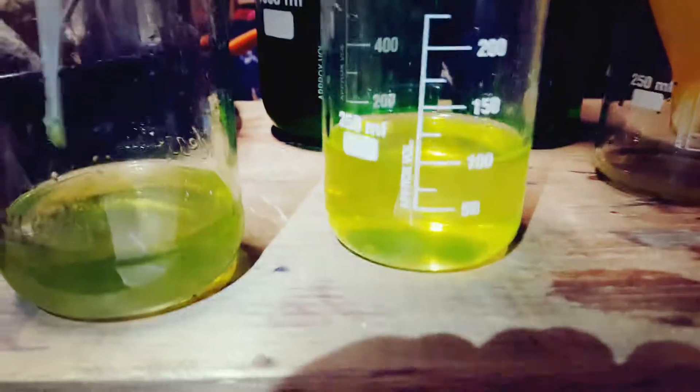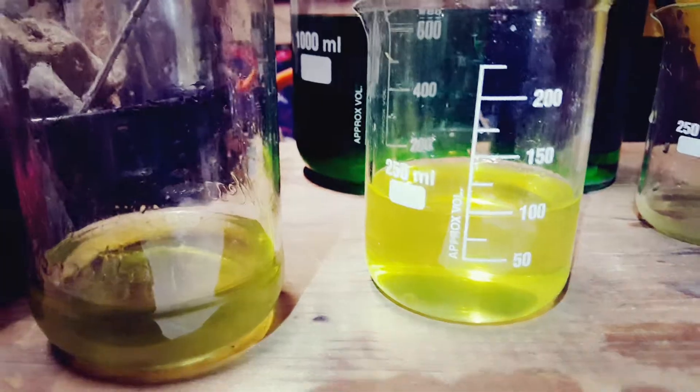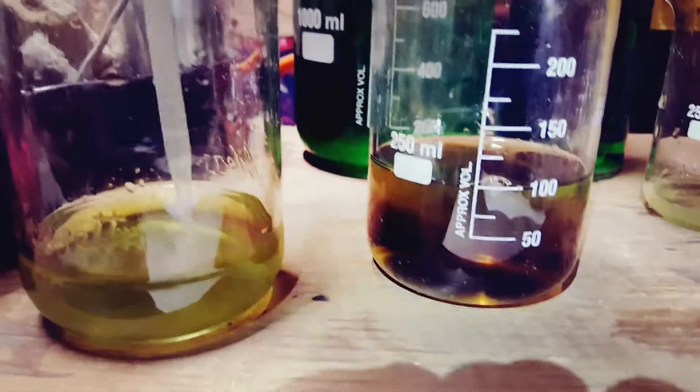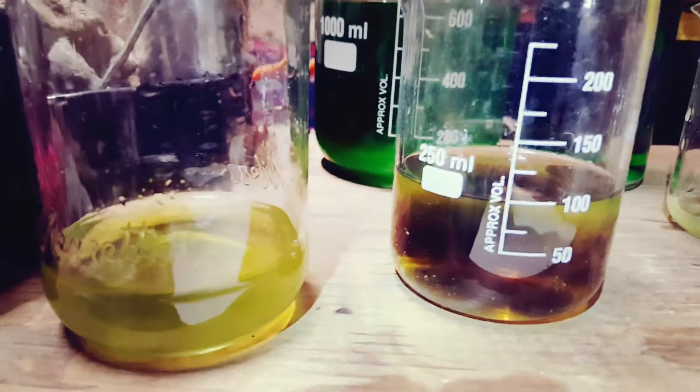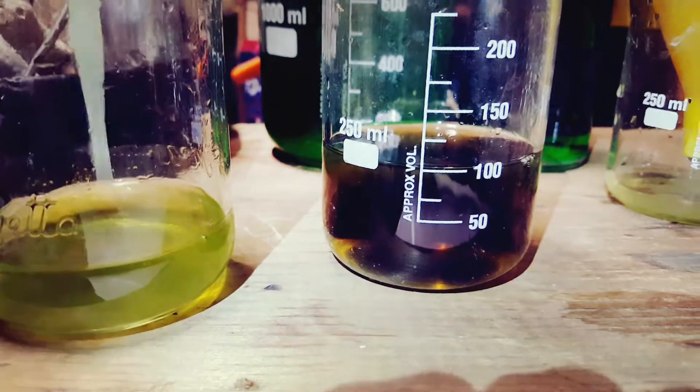To my left is my solution, which will precipitate out the gold, and it should start immediately. Oh, there it is! Woo-hoo! That right there, my dear, is 24 karat pure gorgeous gold.